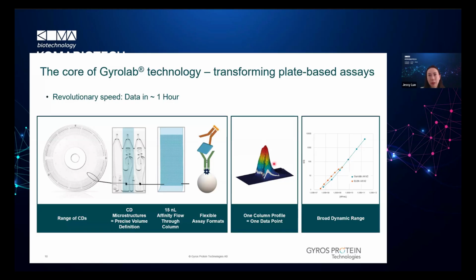It is fluorescence signals. Using this profile, it is very easy to judge whether our reagents, the detection and capture reagents, have a good affinity with the analyte. If we see here, this is a very good profile. It has a very sharp peak. If it looks like this, meaning we have very good affinity, but if it is a tagged, long-tailed profile, then that means the affinity is not so good.